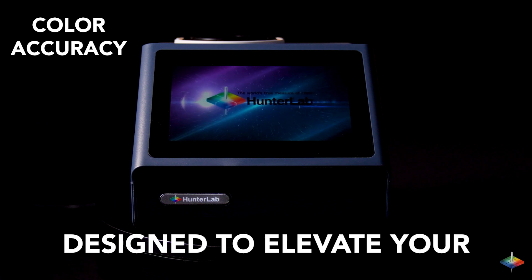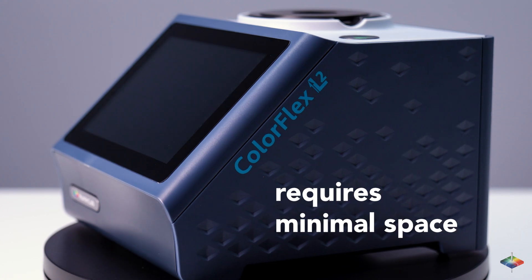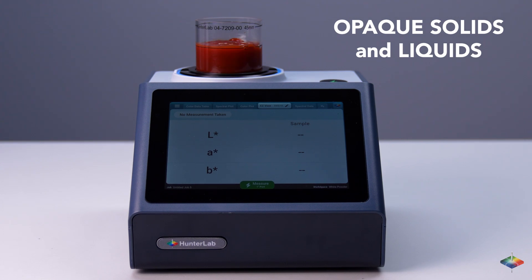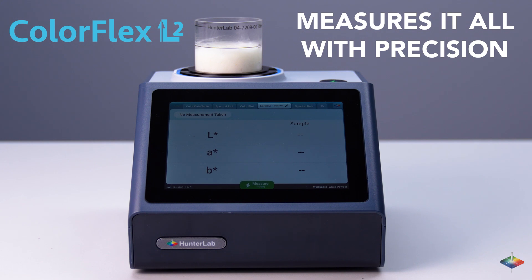Designed to elevate your color accuracy and user experience like never before, its compact and ergonomic build requires minimal space while offering enhanced durability and reliability. From opaque solids, liquids, powders, and granules to translucent solids and liquids, the ColorFlex L2 measures it all with precision.